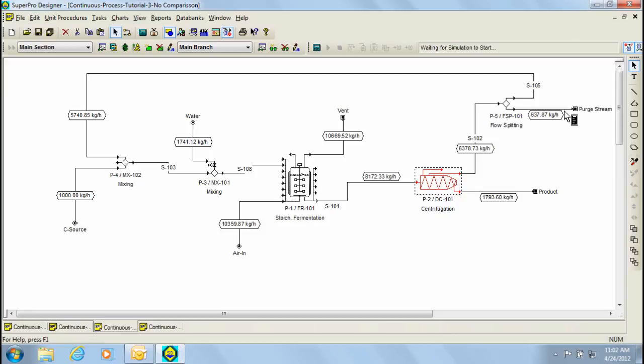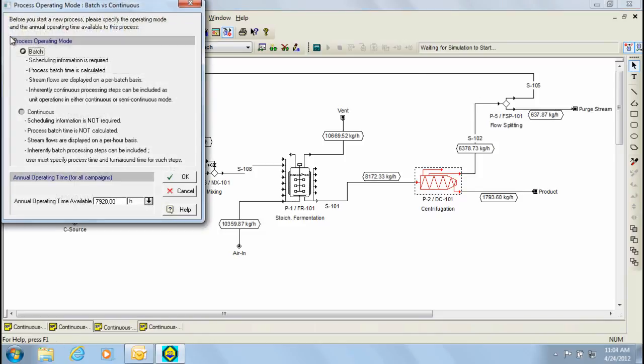Let's now open up a new process file to build the same model from scratch. To open a new process file within SuperPro Designer, you need to click on the add new process file button on the top left hand corner of the window. When you do that, the process operating mode dialog pops up. Here you can select which type of process you'd like to model, batch or continuous. Let's select the continuous option and click ok.